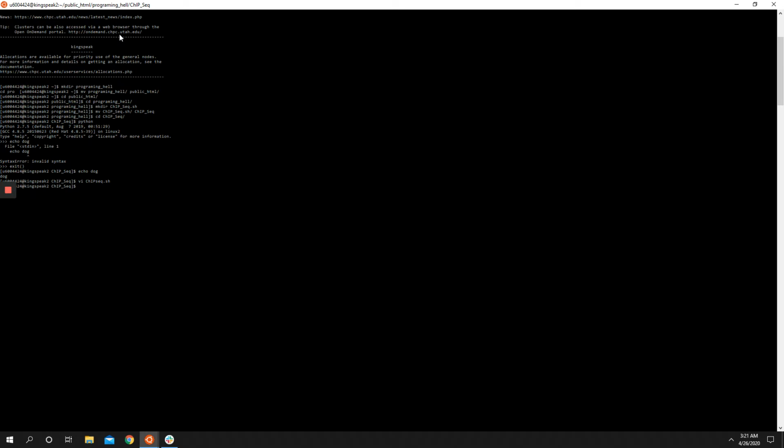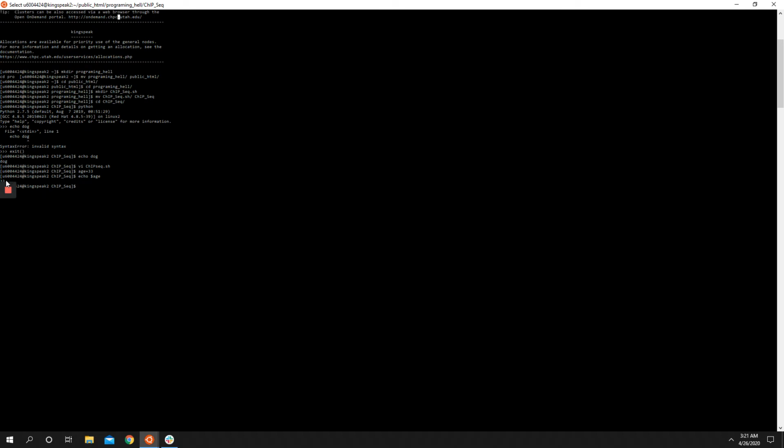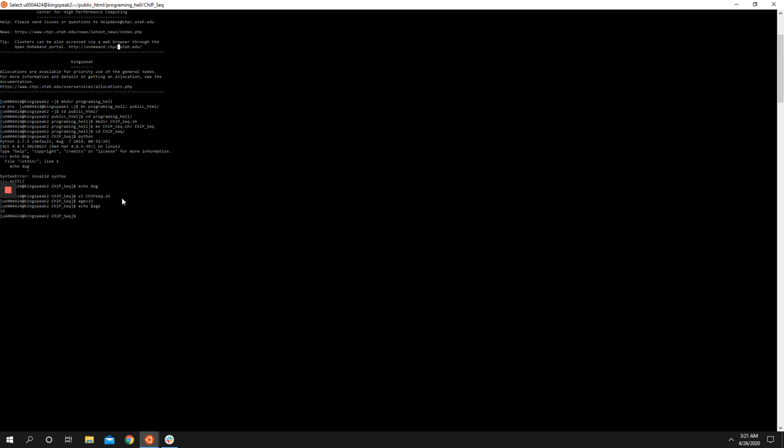So let's say age. I'm 33. So I can say set the variable age equal to 33, and then anytime I reference that, in order to call it back up, I have to do $ and then age. So now it'll just spit out 33.